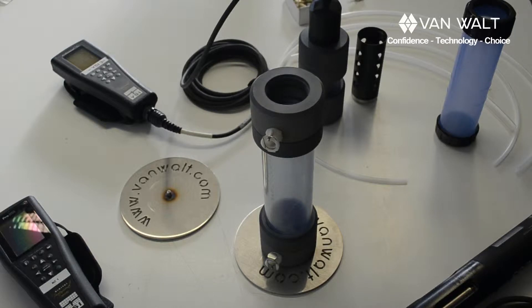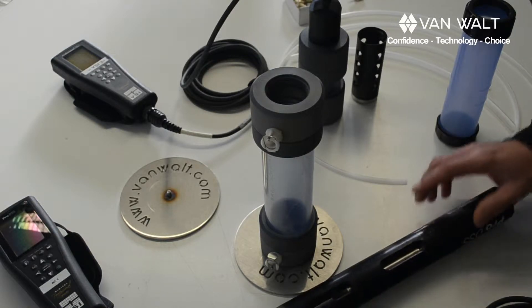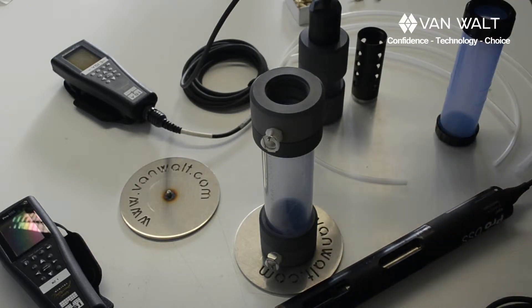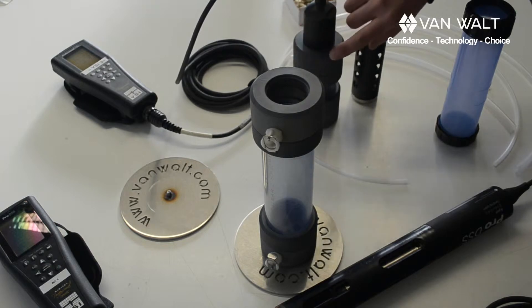This is a quick overview on flow cells. We've got a couple of YSI probes in front of us. This is the DSS and this one already in a flow cell is the Probe Plus.